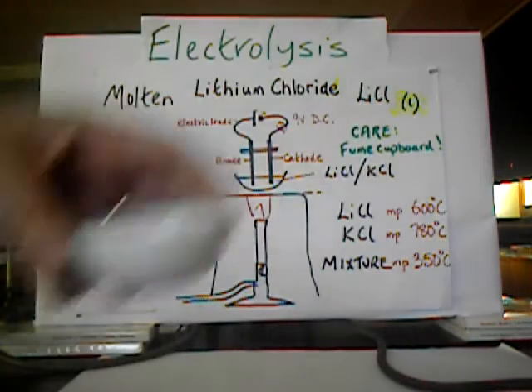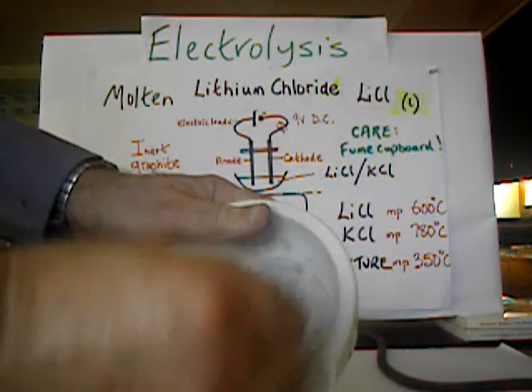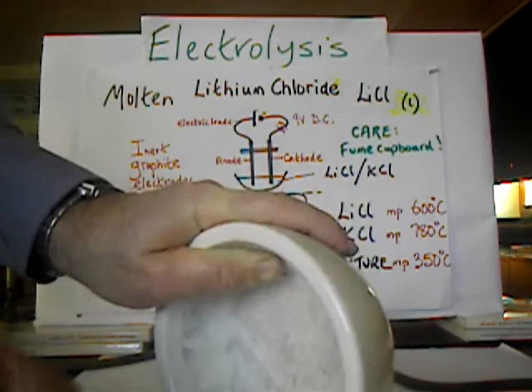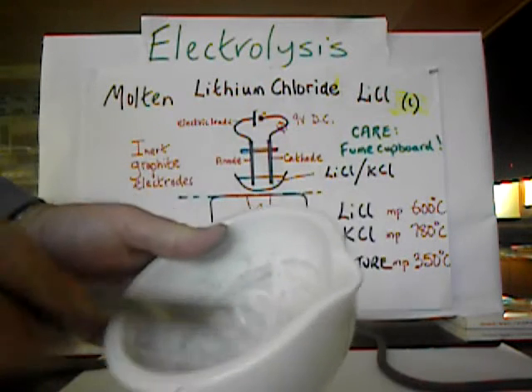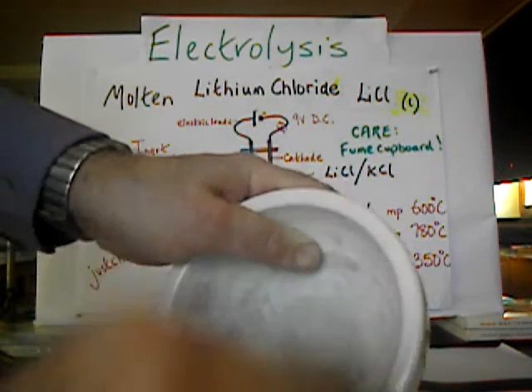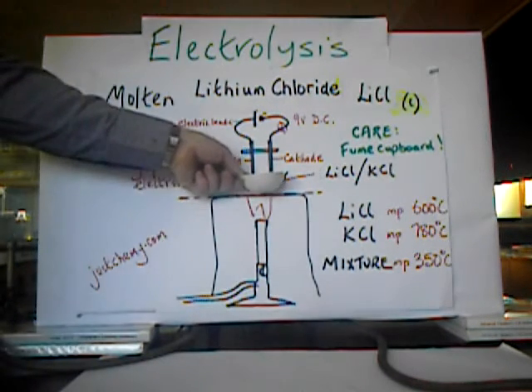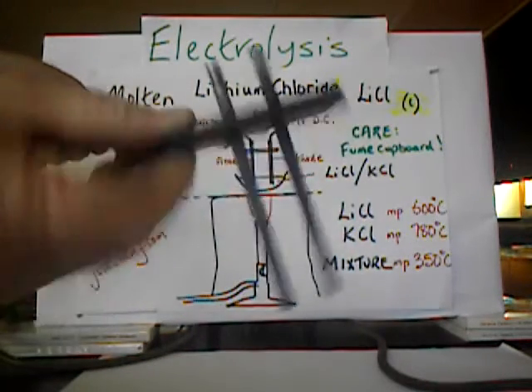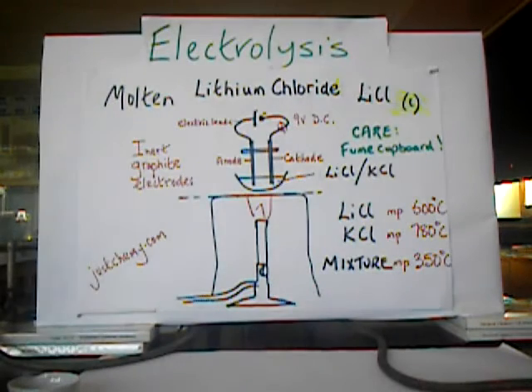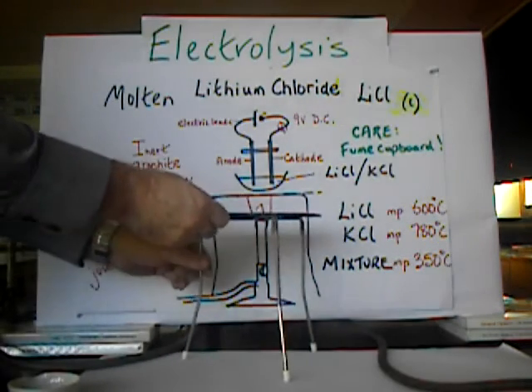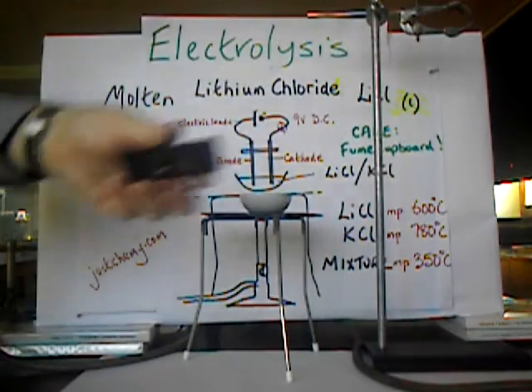I'm taking a small evaporating basin and transferring this mixture — approximately 55% lithium chloride. This should technically be 55% of the total moles as lithium chloride to get the mixture with the lowest melting point. So here I've got my mixture in the evaporating basin, which will be set on the tripod gauze. These are my graphite electrodes — inert graphite electrodes. Inert because they don't get involved chemically; they just conduct electrons in and out of the electrolyte.